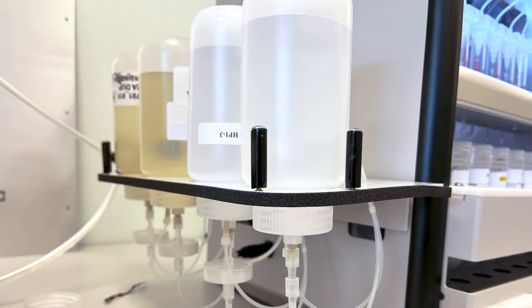You're absolutely right. With the SPE03, your options are kept open. This configuration here would work with drinking and non-drinking water methods, whether they're standardized or developed in-house. Great!